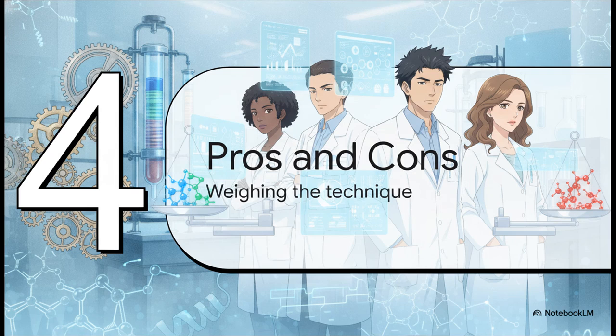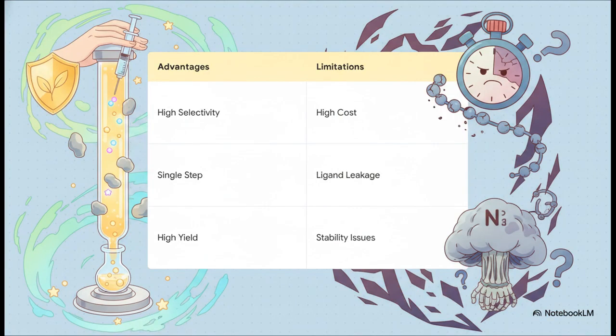Let's weigh the technique. Look, no analytical technique is absolutely perfect. Now, the advantages of bioaffinity chromatography are genuinely staggering. I mean, we're talking extremely high selectivity and literally thousands-fold purification efficiency in a single step, plus excellent recovery of biologically active molecules. But we have to impartially weigh the limitations too.